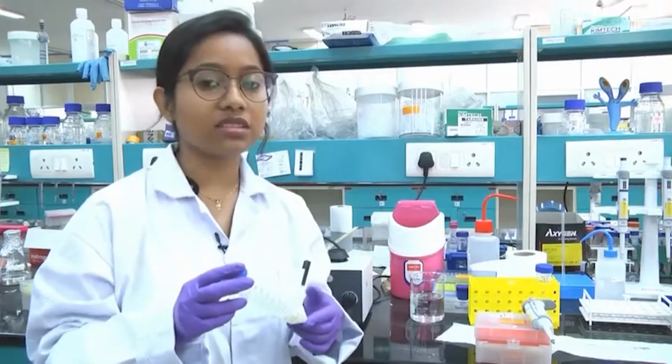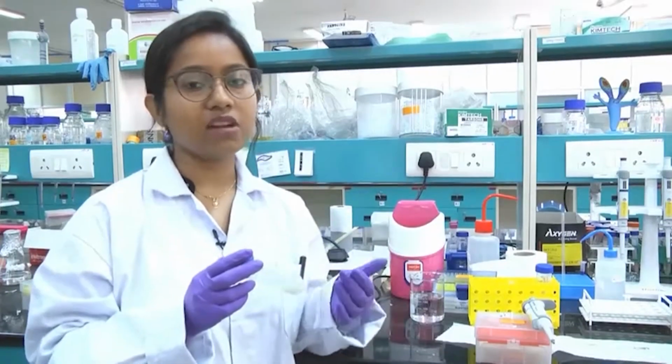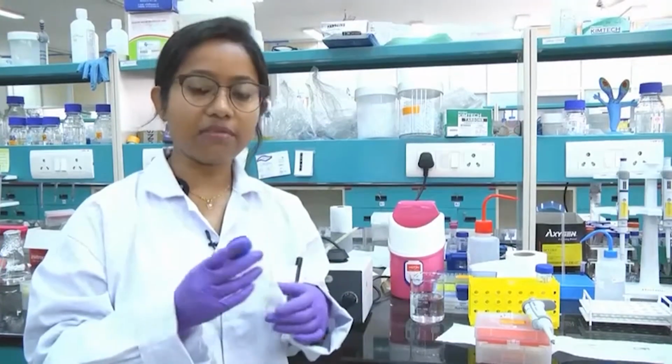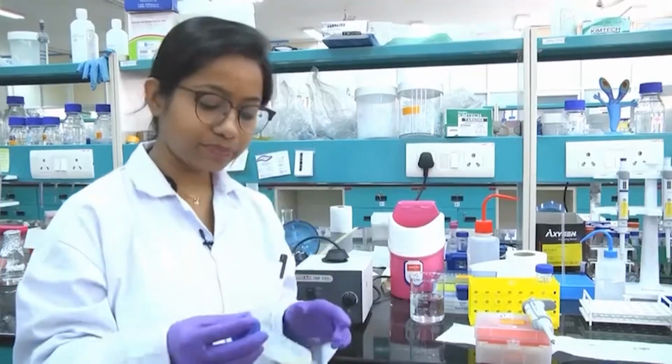So, it is best that you express the protein, then get the pellet, dissolve it in lysis buffer and keep it at -20 or -80, and whenever next day or some other day when you have time, you start characterizing or isolating your protein of interest.